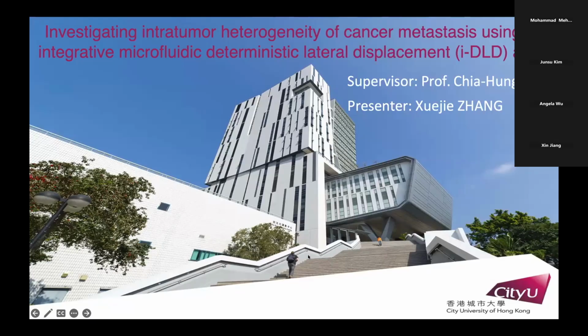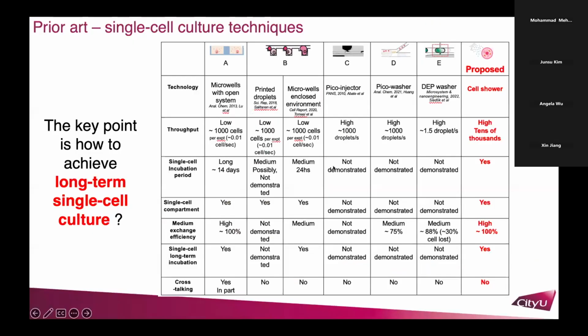As we all know, currently the microfluidic-based platforms have allowed us to study cell behaviors, functions, and cancer-related mechanisms at single-cell resolution, and this kind of resolution has generated a significant leap for today's research.